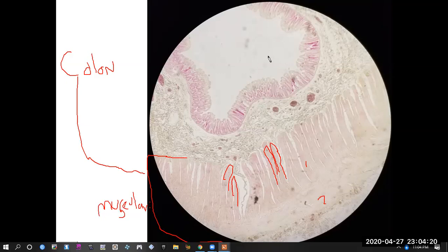So starting from the luminal surface from the inside, there's the tunica mucosa that once again will have a layer of simple columnar epithelium. Can't quite make out yet. We have to cross the area of that second sublayer. And then you can start to see that line right across here. Again, we're at low power, but that's the location of the muscularis mucosae.